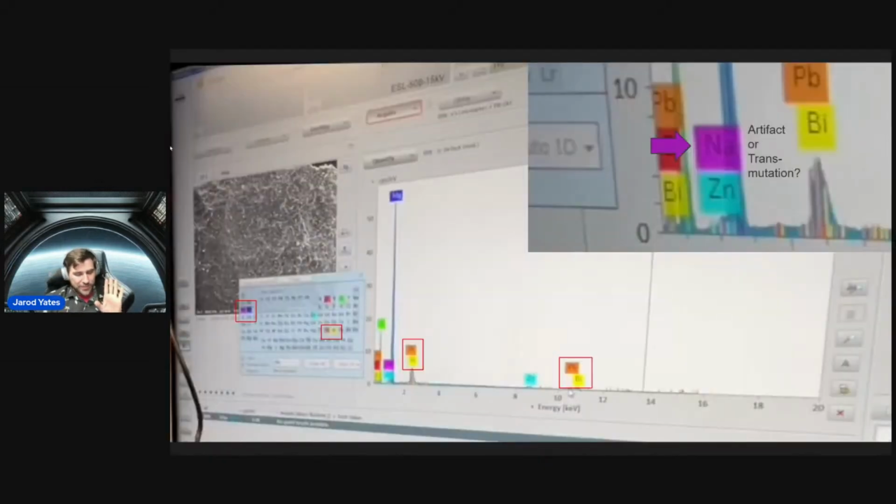All right, now this part is kind of weird. When you're down here in the noise floor, like I said, you can't always trust it, but you still got to consider it at least. In the noise floor over here for one of these, this is an image that Mark took while he was at the lab. He took his cell phone over there and recorded the whole thing. And this didn't make it into the report that they gave us, but I thought that was interesting enough to still share. So we have sodium, Na, right next to the magnesium on the periodic table.